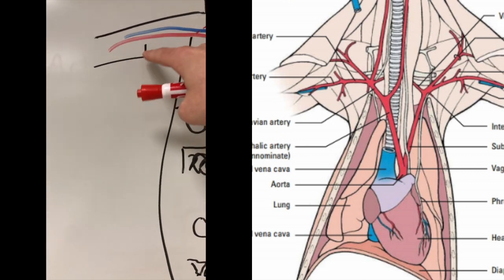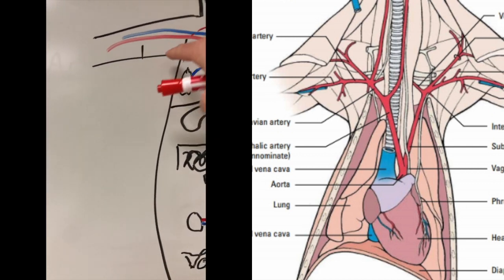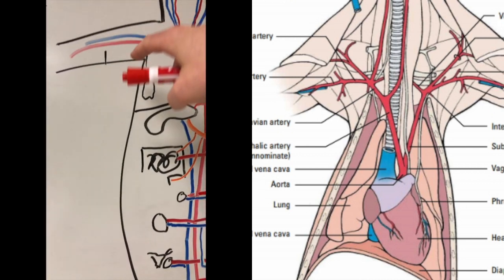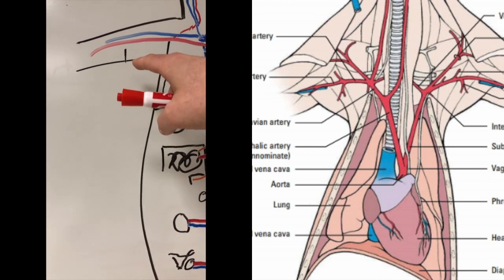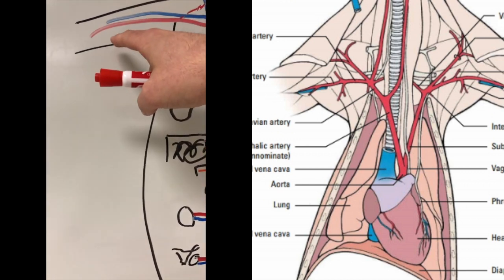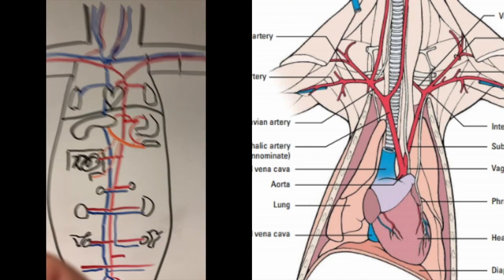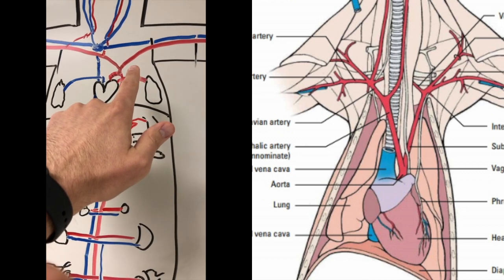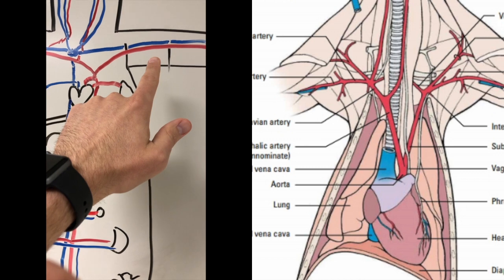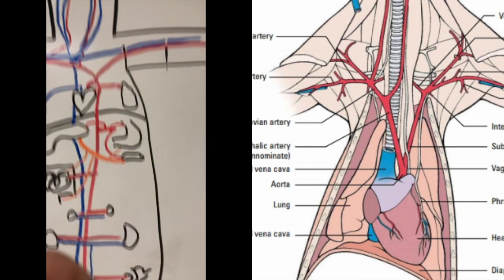And then over here, after just a little bit, there are actually a couple of landmark veins, but for the purposes of understanding this, just mark it as a region. It transitions and becomes the brachial artery right there. And likewise on the other side, this is the left subclavian artery, the left axillary artery, and the left brachial artery.